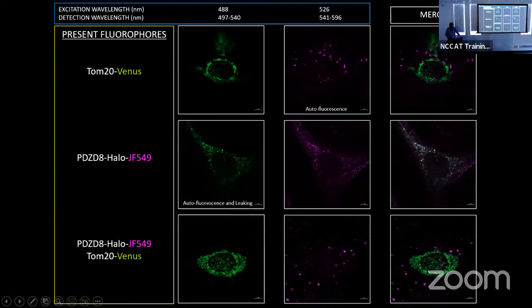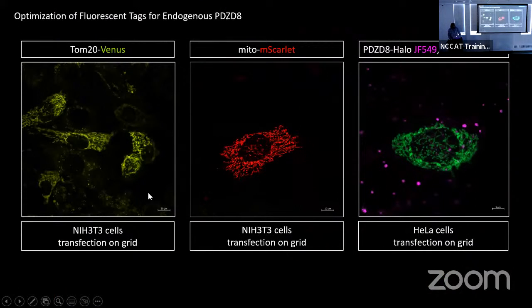So this might help you. It's all over the cell. So that's all mitochondria. It forms a giant network inside the cell, and it's very dynamic, so it moves around.